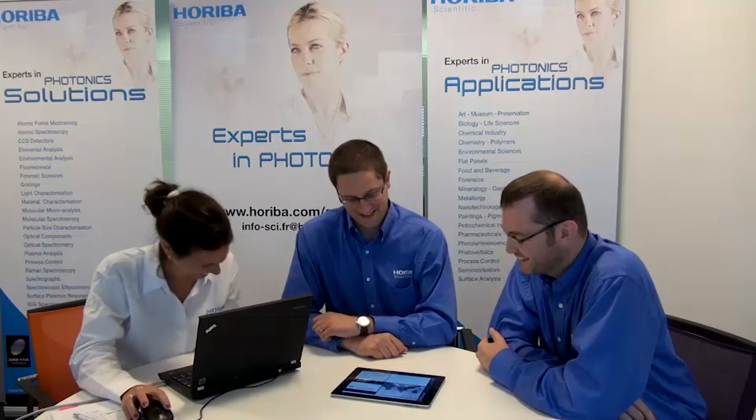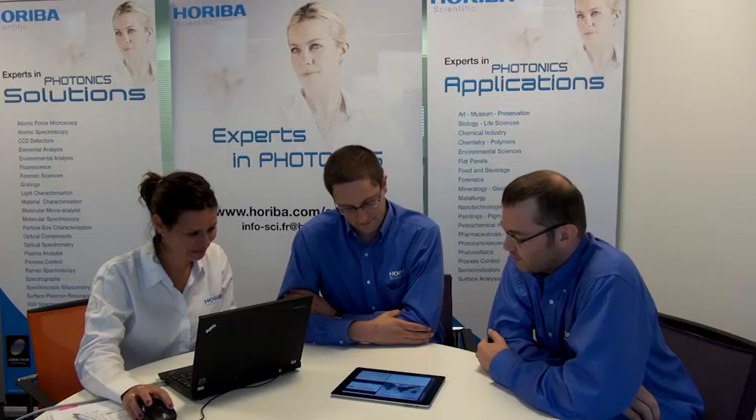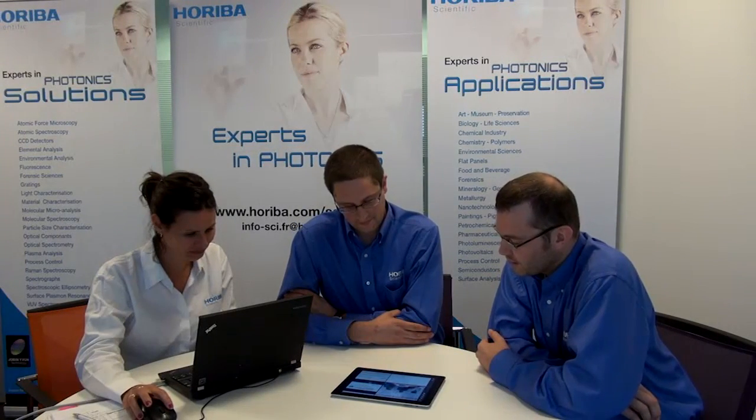Okay, so 2 more questions. Sorry, guys. No problem. With Aqualog, we often have a problem of saturation. Is it possible to get a fluorescence up to 50,000 counts? 50,000 counts. With CCD? Yes, we can. Actually, it's higher than this.